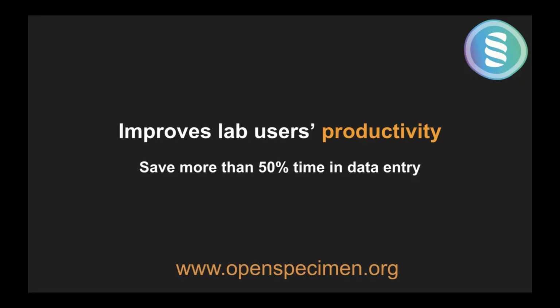In 10.3 OpenSpecimen, you would go into each patient and have to repeat that process for every visit, so every patient you'll have to do separately. But with workflows, you will be able to do that across patients in one go. So the amount of time you save could be a lot more than 50%.